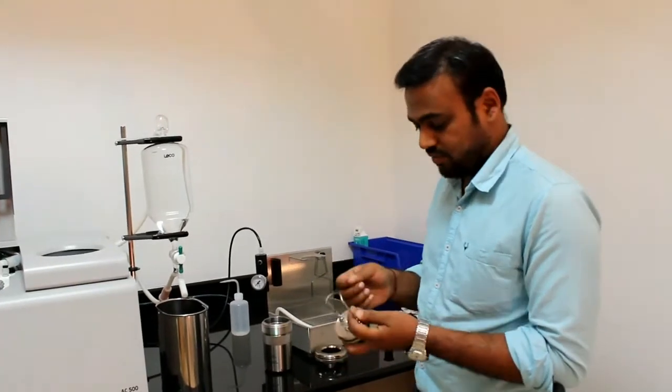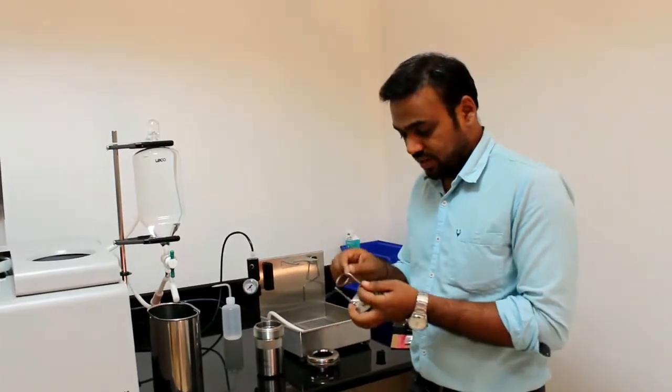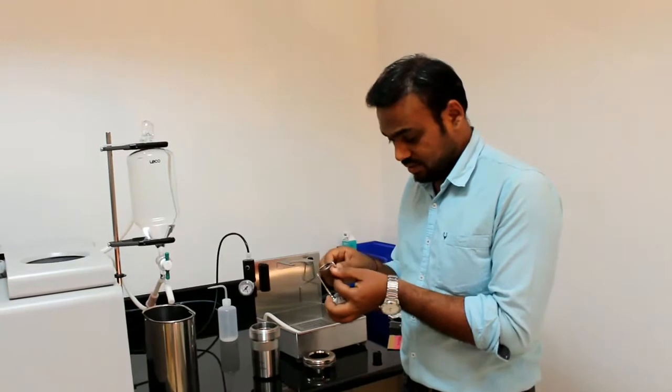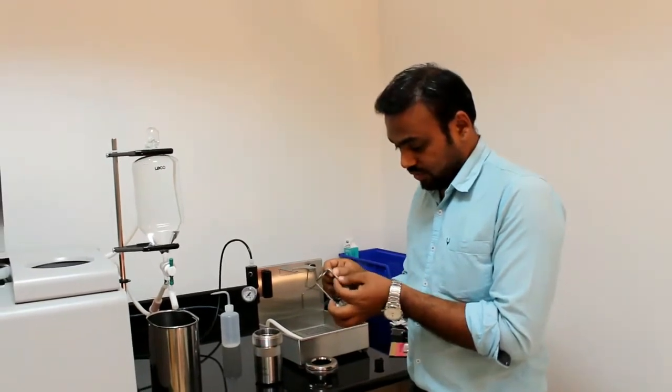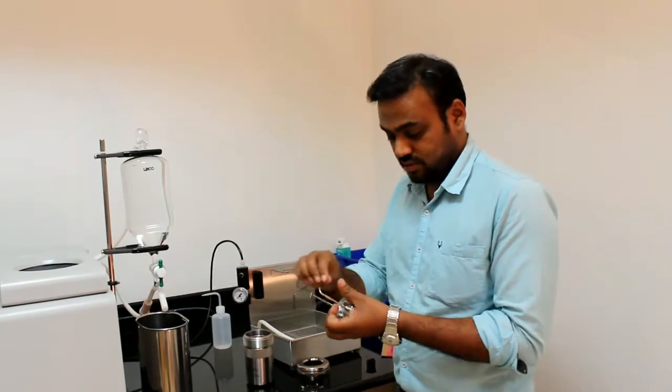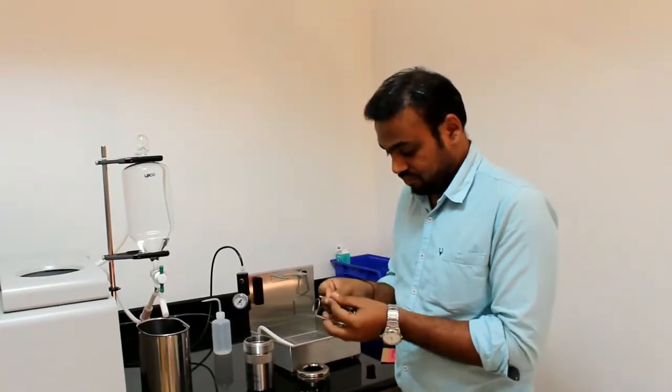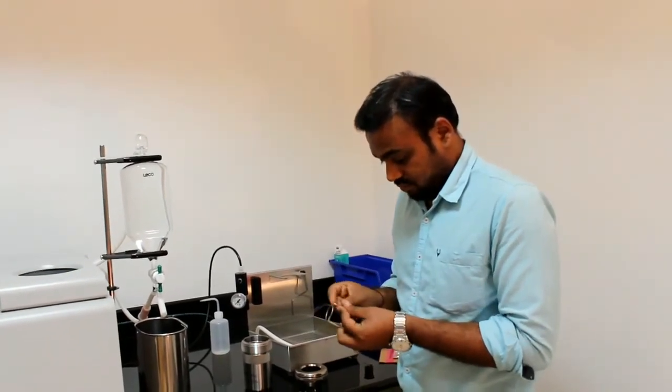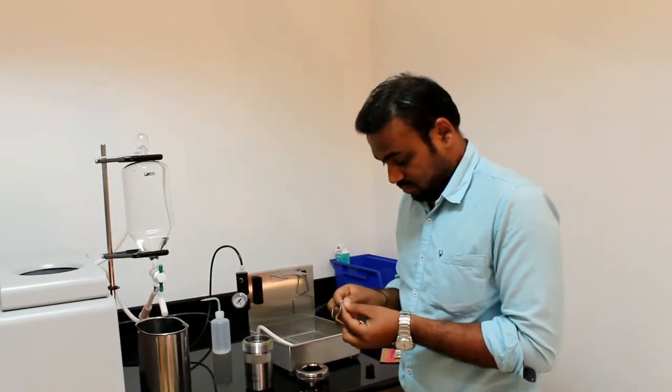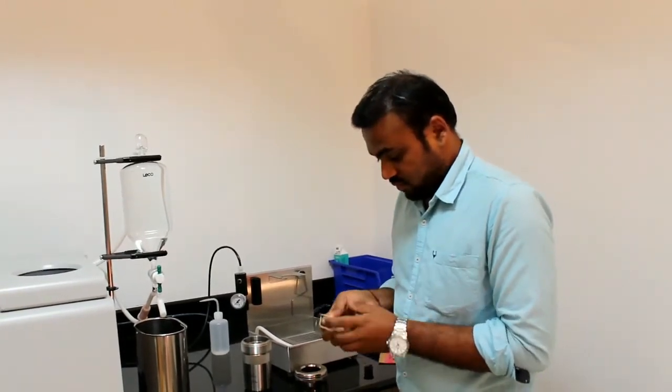We have two types of combustion fuse, one is thread and another is wire. This is a wire-based combustion fuse. Then we have a notch, so that we can easily put this wire. So now it is tight.